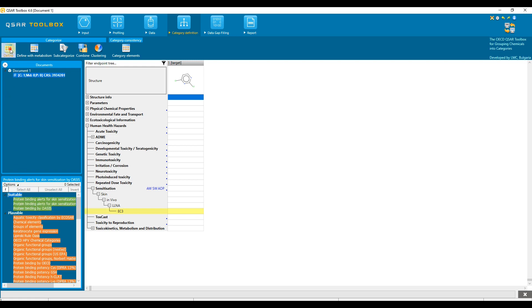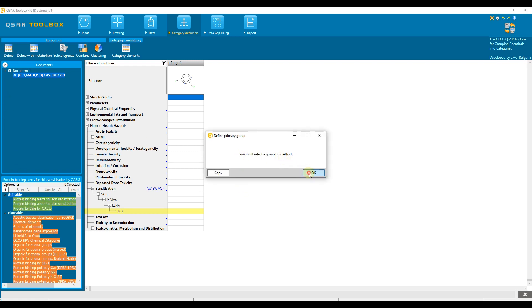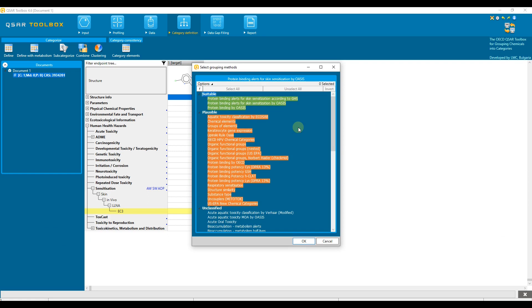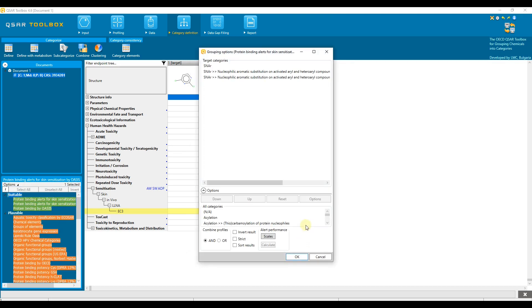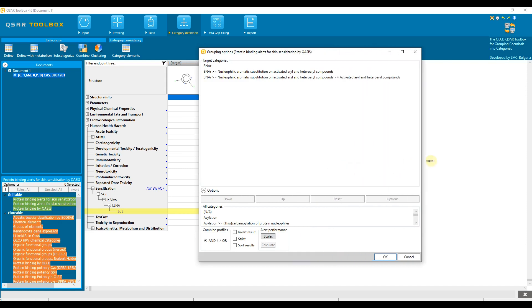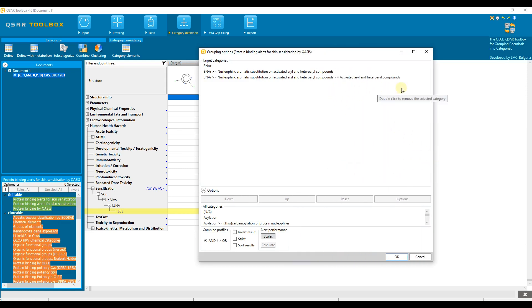You can also select a profiling scheme by first clicking the Define button. Then all profiling schemes appear in a separate dialog, again reordered and highlighted by target endpoint. Select protein binding alerts for skin sensitization by OASIS and confirm. The target's profiling result appears in the next dialog. A protein binding alert was found in the structure of the target.